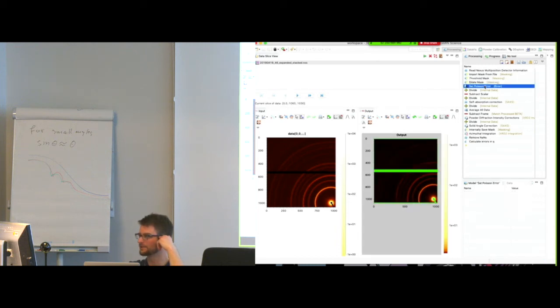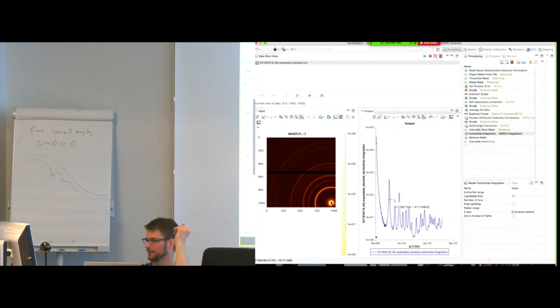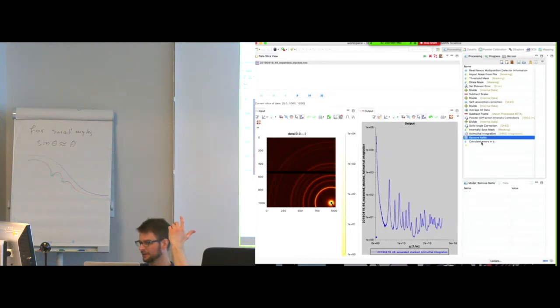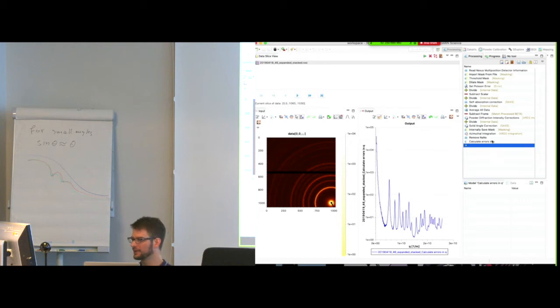Now, as Tim said, it can be super tedious to fill in all the data correction steps for this. But one of the things we can do is we can take a file which has already been processed at a previous date and just drag that processed file into your pipeline. And there we go. And that then populates the pipeline with these steps as you had used them in your previous correction. So, even if you forget what you did to correct one of your previous data files, you can find that out later on. And if you click on one of these steps, the output window shows you the state of your data at that particular step. So, I can now step through my corrections and see what every correction does. And this is particularly handy when one of the corrections doesn't work. You can find out which correction gives you a problem.